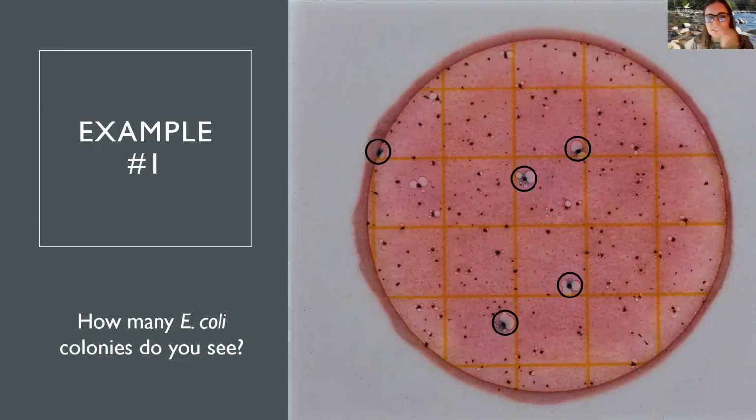We can see all of these other little colonies on here, and they do have gas bubbles, but those are the red colonies Jackie explained. Those are just our general coliform, which is not what we're looking for, right? We're sticking with that indicator species of E. coli. Thanks everyone for chiming in. You did pretty good. Everyone got really close.